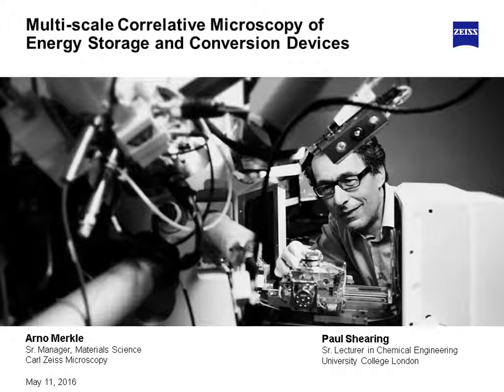So there's a challenge with storage, and definitely a challenge with the post-acquisition quantification. I think what we'll see in coming years is an increased automation of the whole imaging workflow to enable these higher throughput experiments to become more routine.